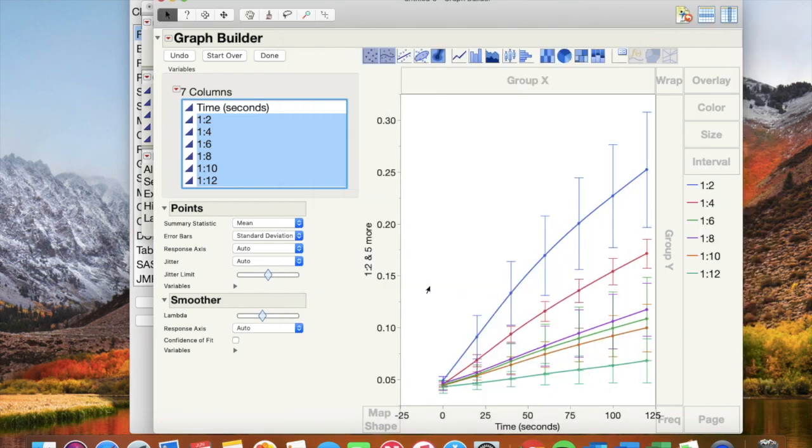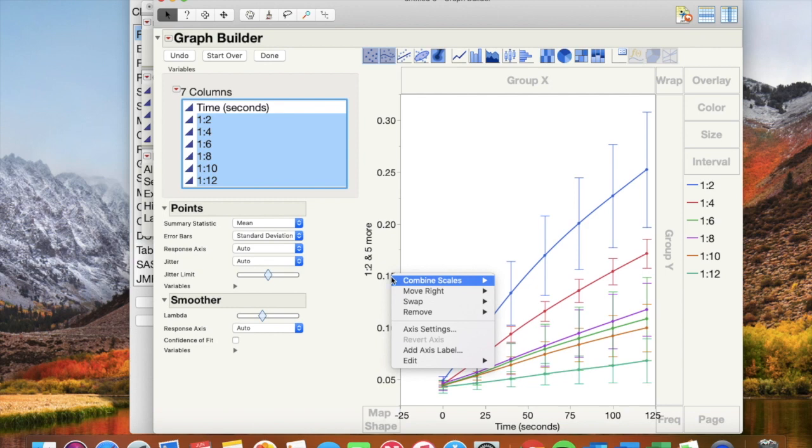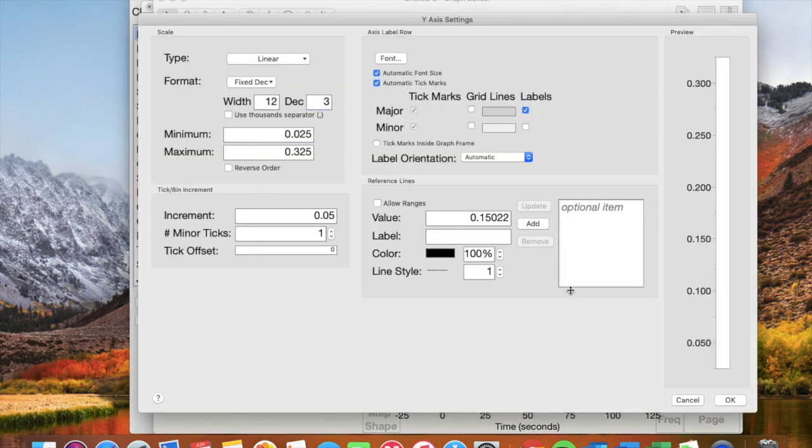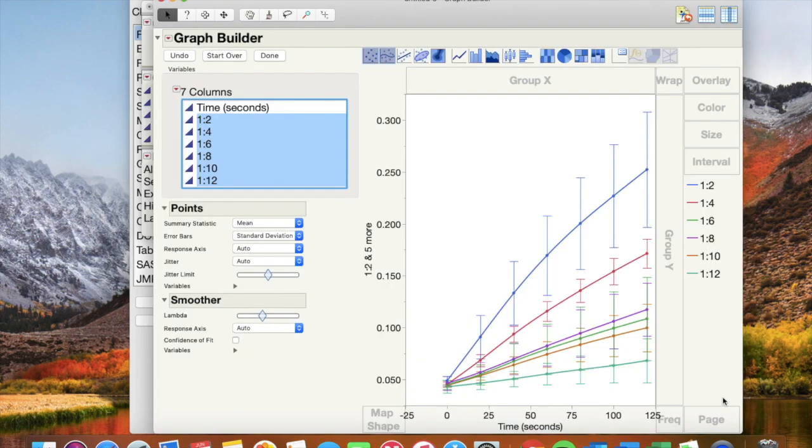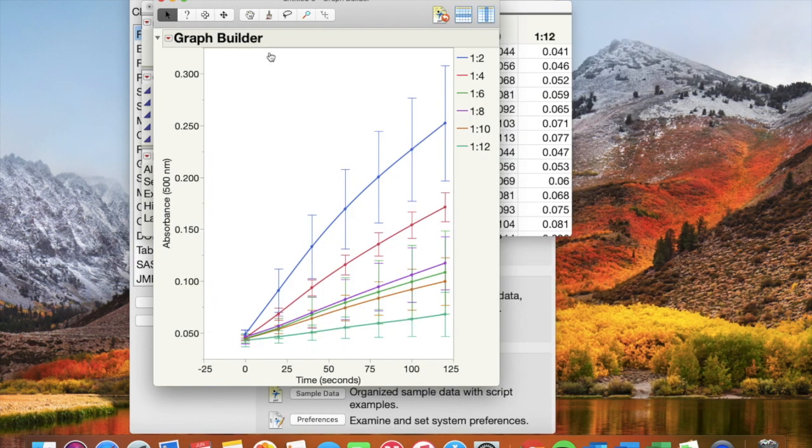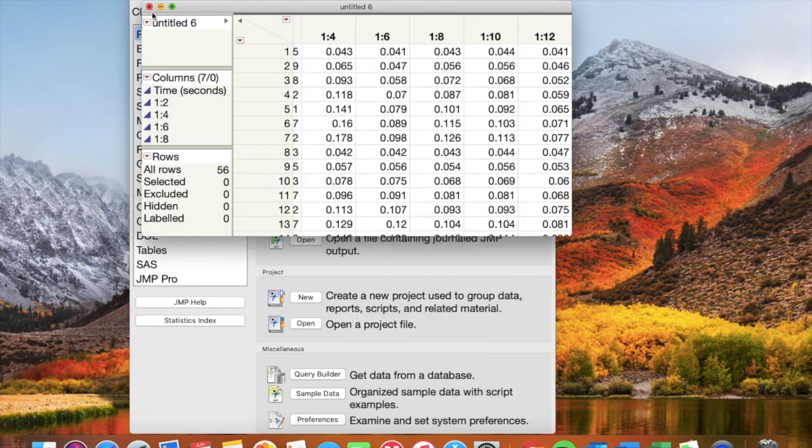Then click on the vertical values and go to axis settings, set it to three decimal places. Change your axis label with the appropriate units. Click done and save your graph with the report. I chose the 1:6 dilution because my line was linear but not flat.